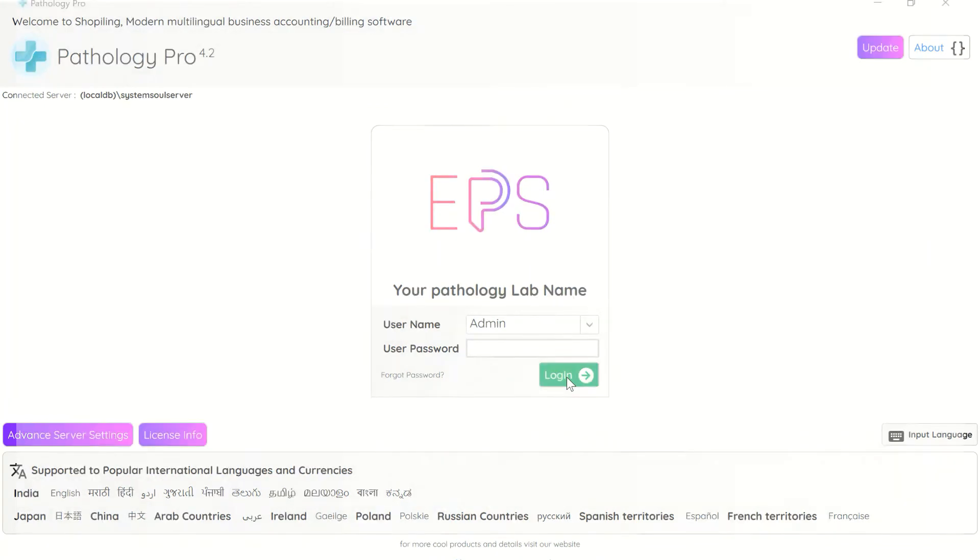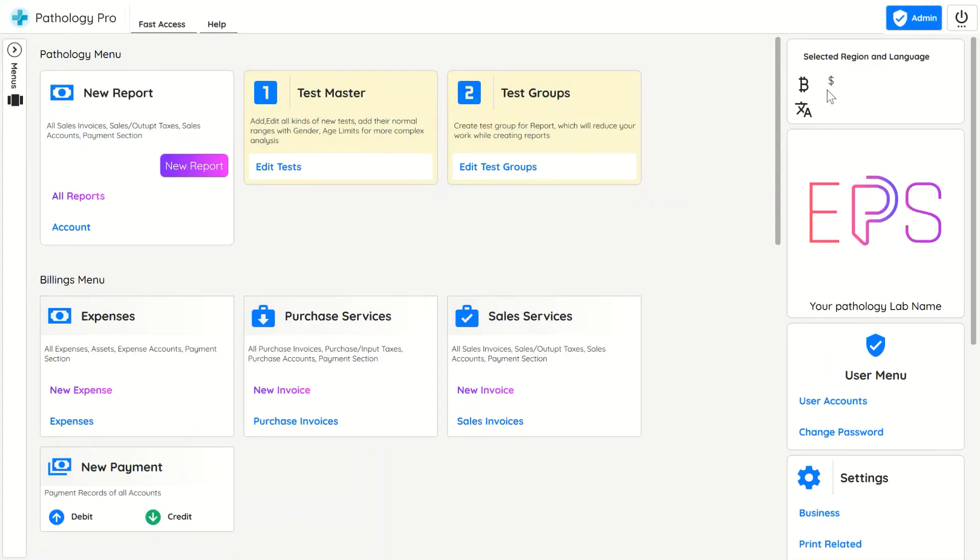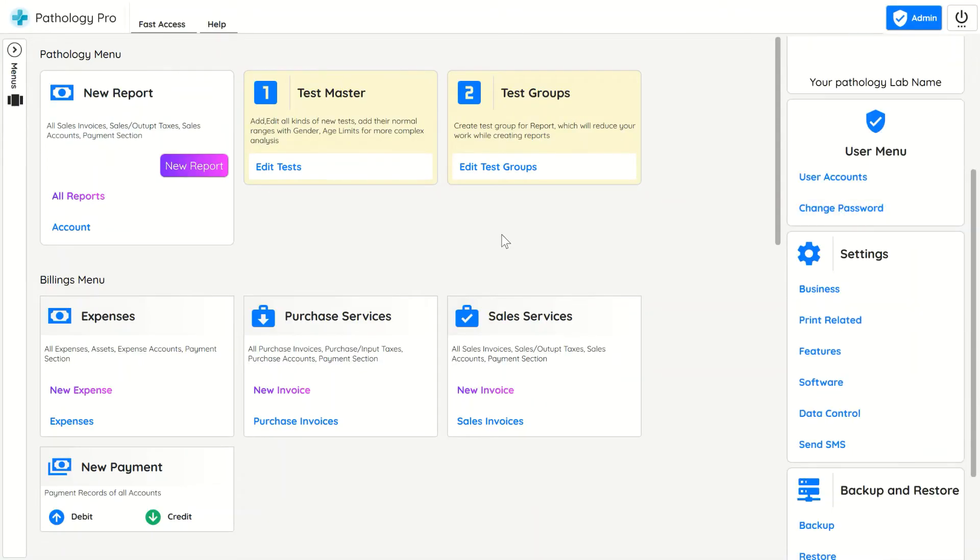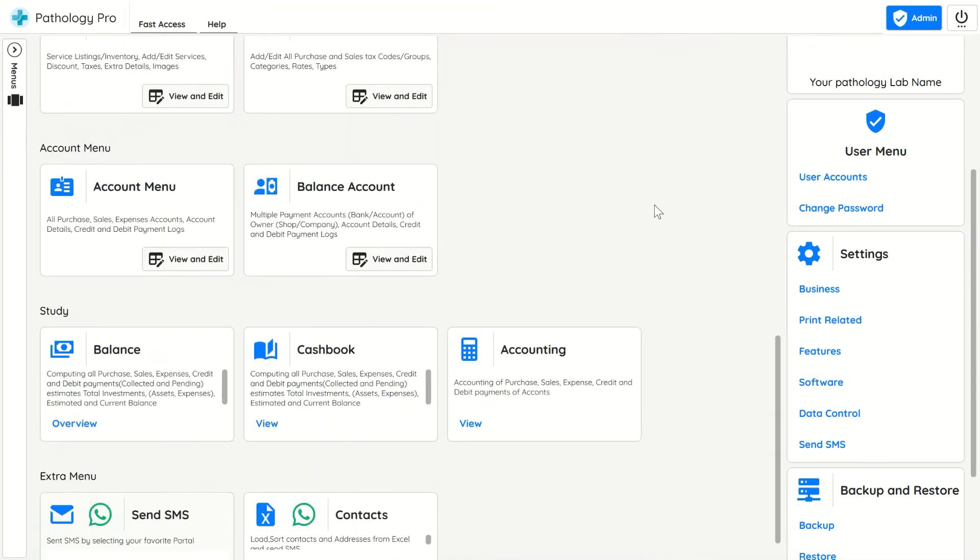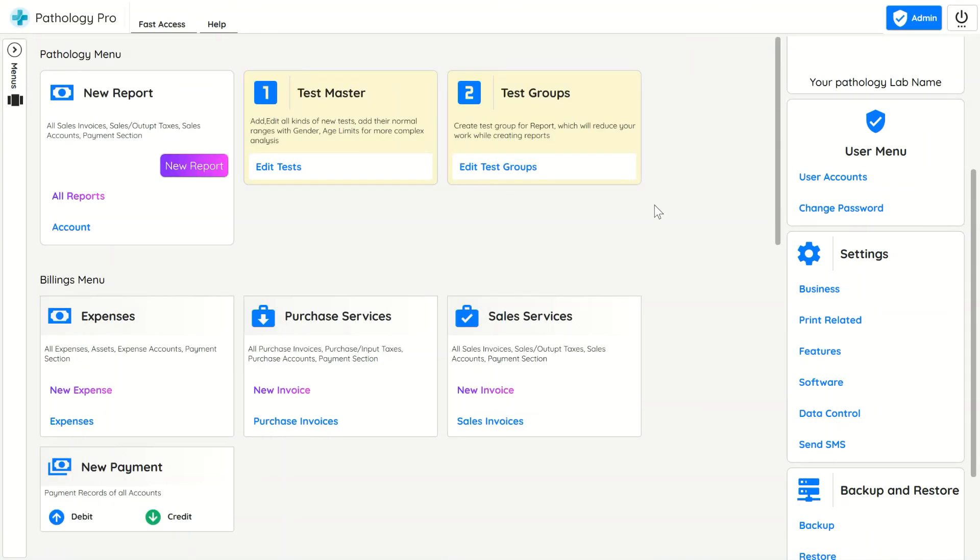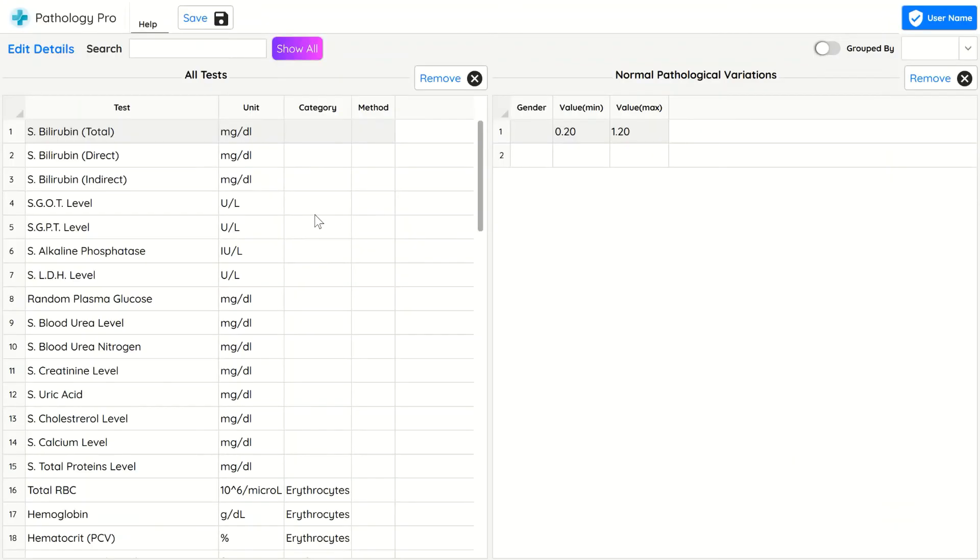Login into the application, you will see all features. In Tests window, you can add any new test in the world manually.